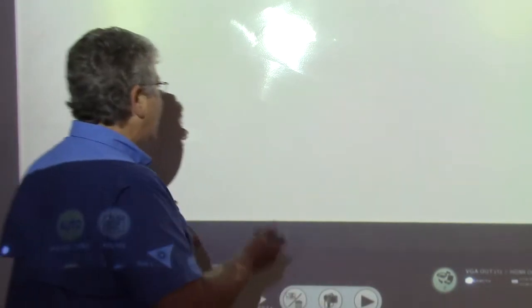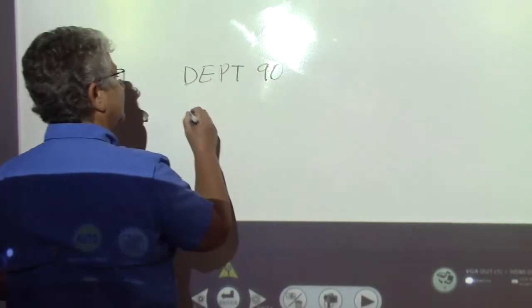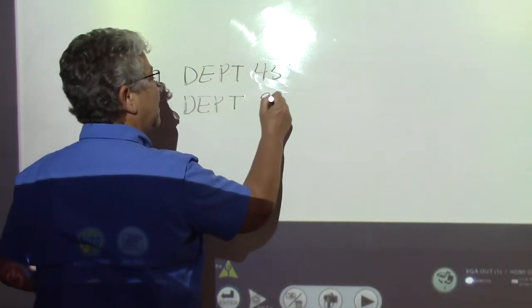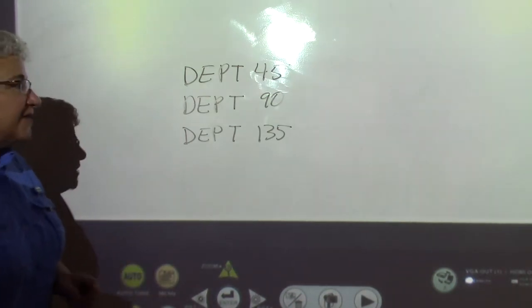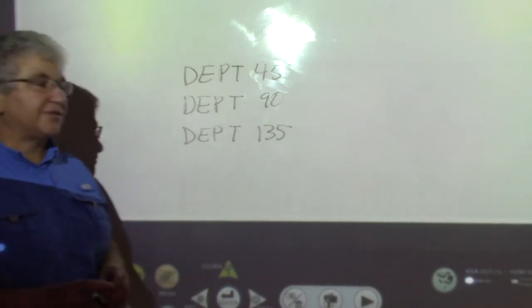And it turns out that when you say you're going to run a DEPT spectrum, there are actually three different DEPT spectra that get collected. We call them DEPT 45, DEPT 90, and DEPT 135, right? And so you don't get to pick and choose. The instrument just runs all three of these for you, and you get the data from that.